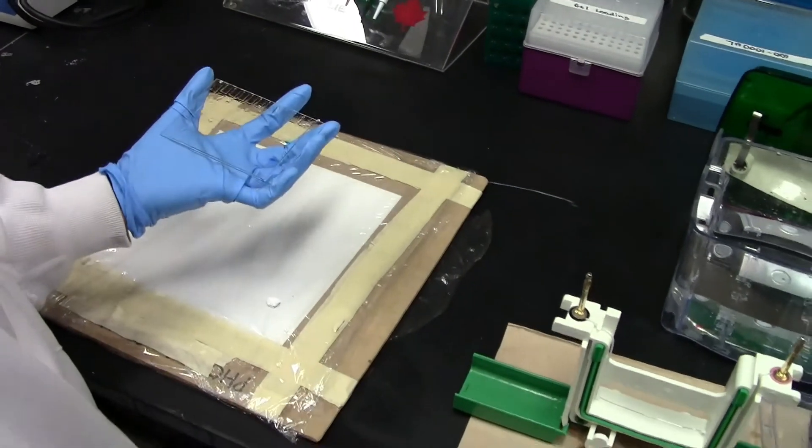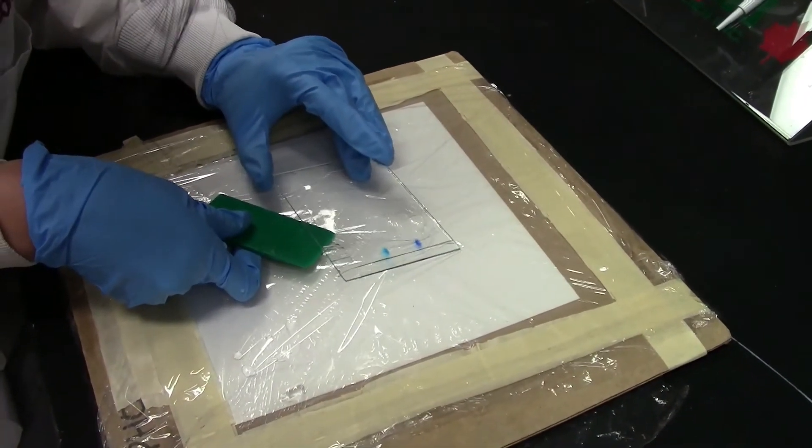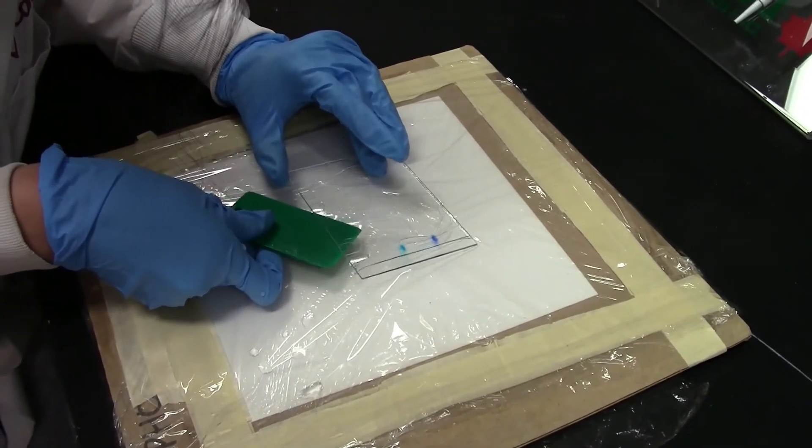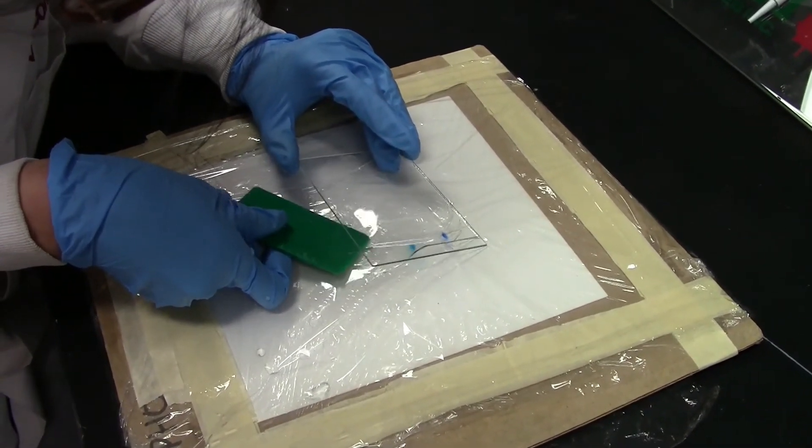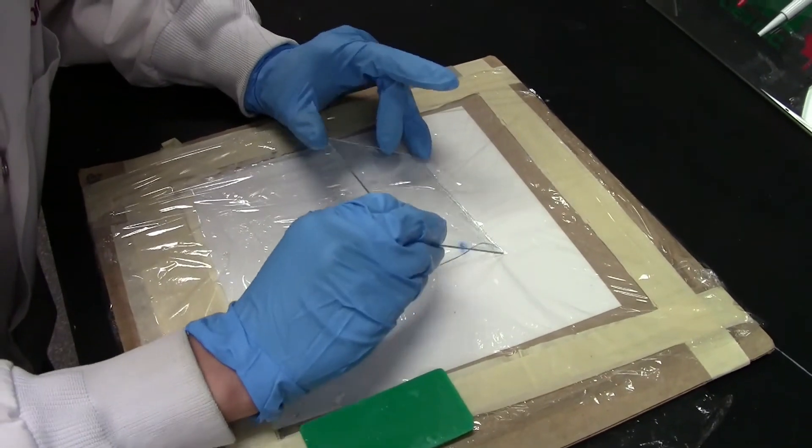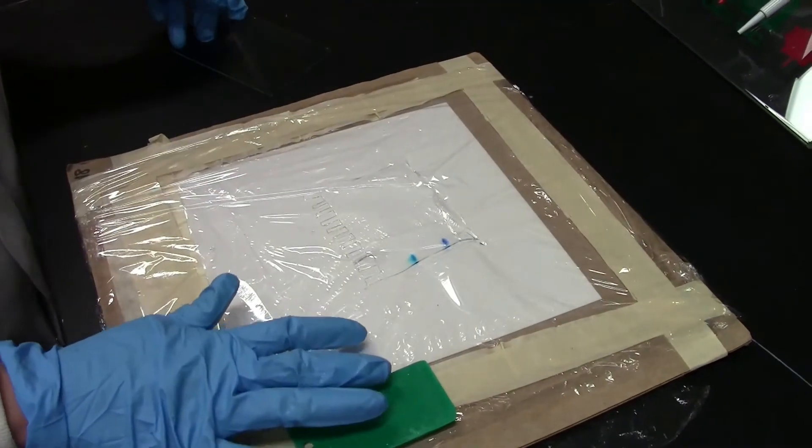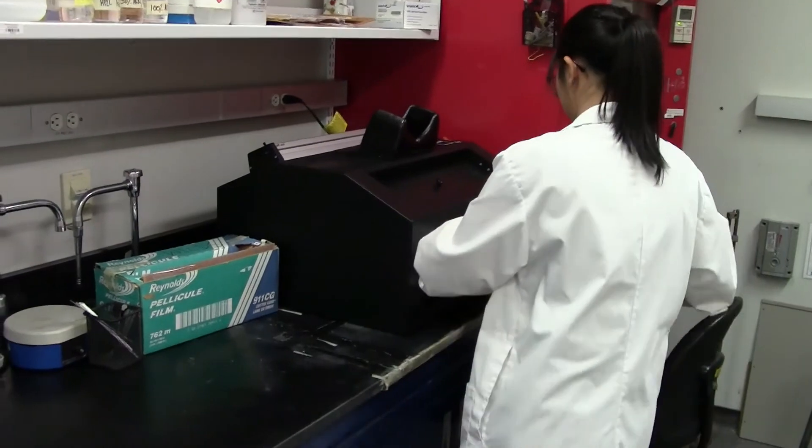Use the gel releaser to pry apart the two plates and then gently transfer the gel onto a square of cardboard covered in a fresh layer of saran wrap. Be patient when trying to transfer the gel onto the cardboard as the gel often adheres to the gel plate and easily tears when too much force is applied.